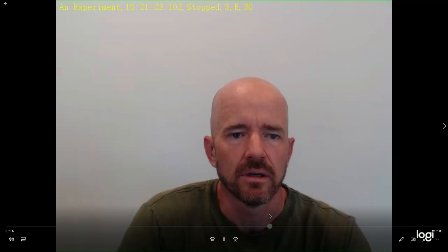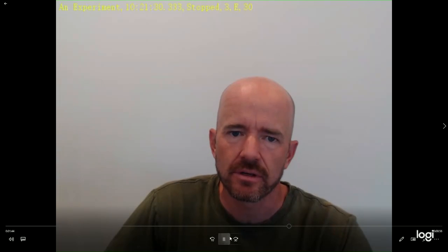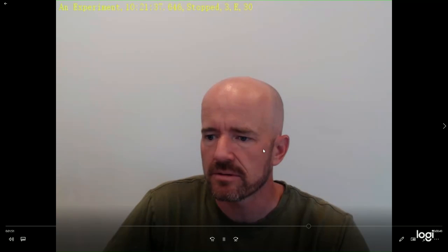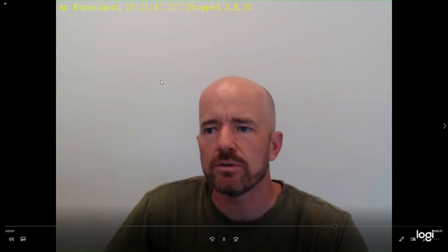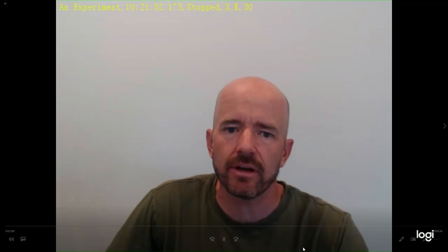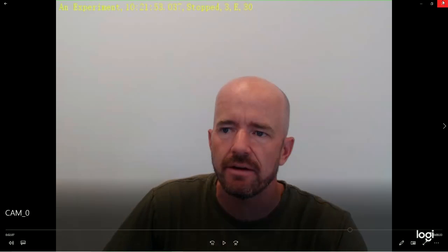So we get a timestamp in the video that's down to the millisecond, so you can go through this frame by frame, determine the interframe timing, and see exactly what's going on with your experiment through the video with the associated experiment name, frames per second, key flags, and whether or not an experiment's being run. So a lot of options there. It makes for a very powerful tool, especially with all of the synchronized video.